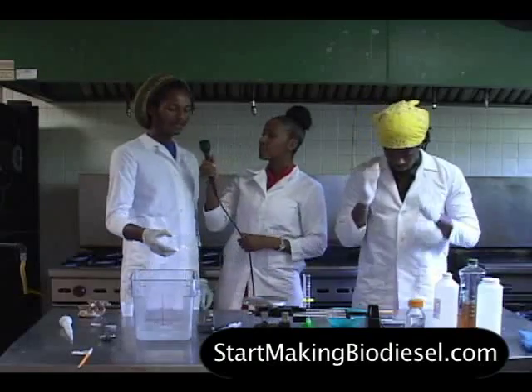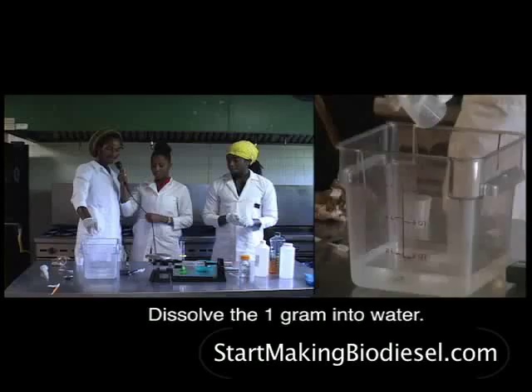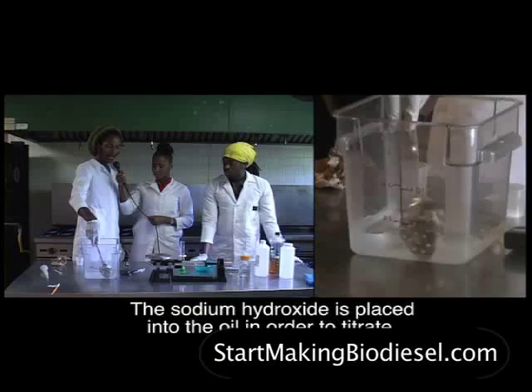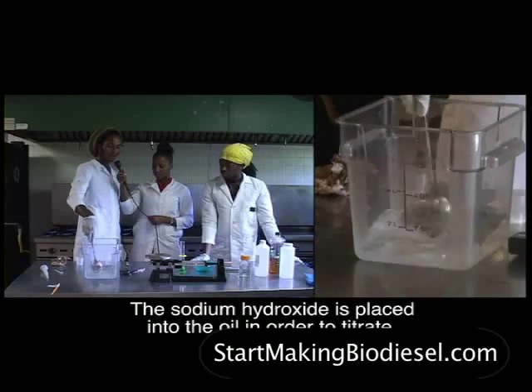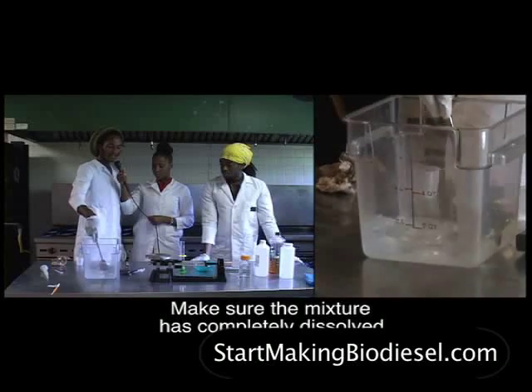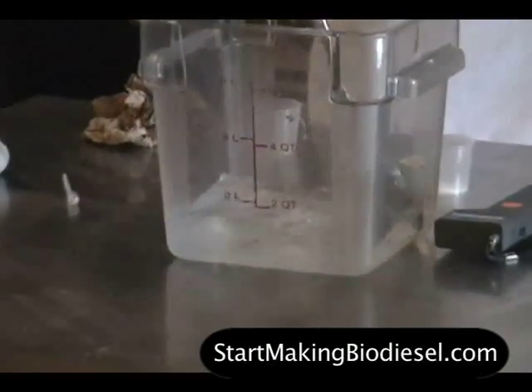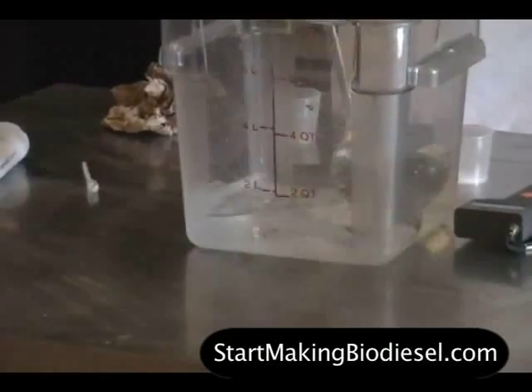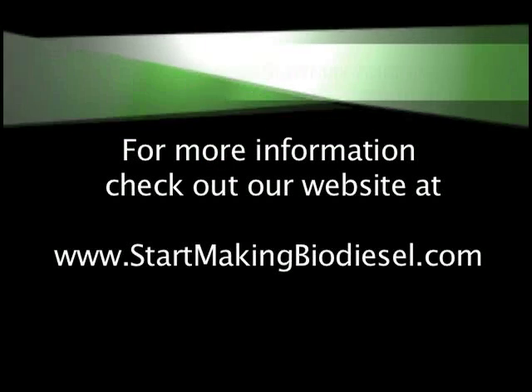You dissolve this one gram into one liter of water. It makes a solution such that every time you drop in a certain amount of liquid, you have a certain amount of grams of sodium hydroxide. We're going to drop this liquid into the vegetable oil solution and determine how much sodium hydroxide was in the liquid to make the pH of the vegetable oil solution to be between 8 and 9.